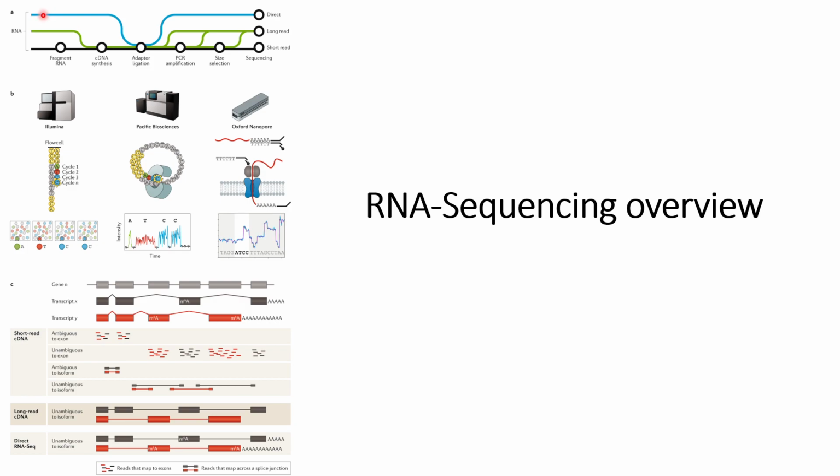In direct RNA sequencing, the RNA is not converted into cDNA; instead direct adapter ligation happens, based on the type of downstream process that will be used, and then it is processed for sequencing.